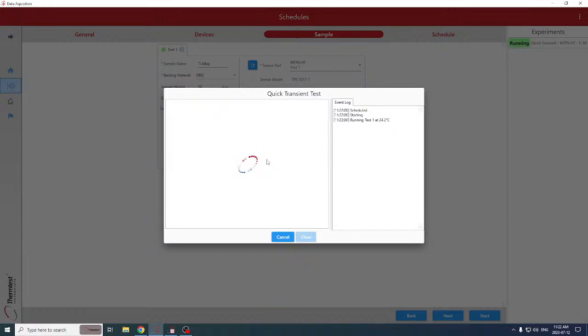And then we'll go to the transient analysis and share data that we measured on both the symmetric version, or the two-sided, and the asymmetric, or the MTPS sensor, and compare both. And you can look at the output of the instrument when measuring powders, or any other solid for that matter. So we'll let this run. This will run first, balancing a bridge that's described in the ISO, and then it will run our 10-second measurement at the prescribed power, and then we can look at that early data and just schedule a measurement.